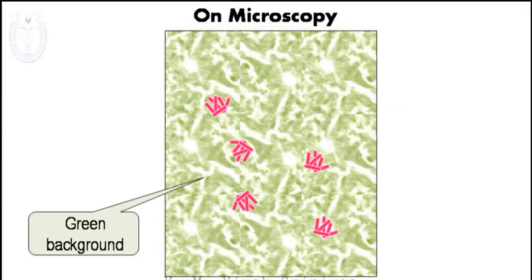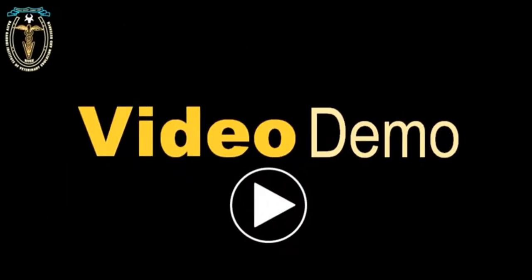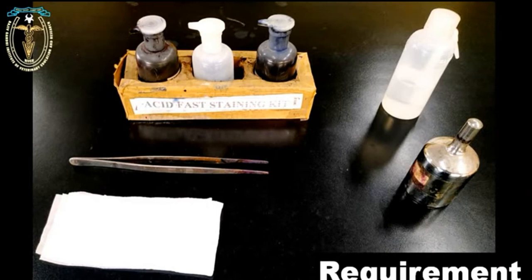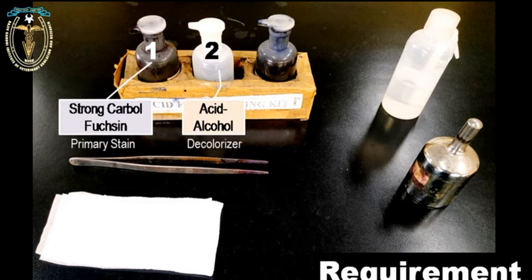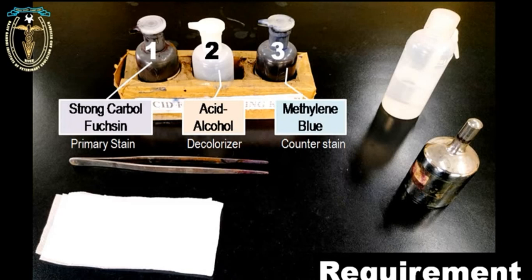The procedure for the acid fast staining technique. The materials required are the strong carbolfuchsin staining solution, which is used as a primary stain in this experiment. The acid alcohol, used as a decolorizer, is prepared by using 3% hydrochloric acid and 95% alcohol. And the Loeffler's methylene blue staining solution, which is used as a counter stain in this experiment. These are the three important solutions required for conducting the acid fast staining technique.